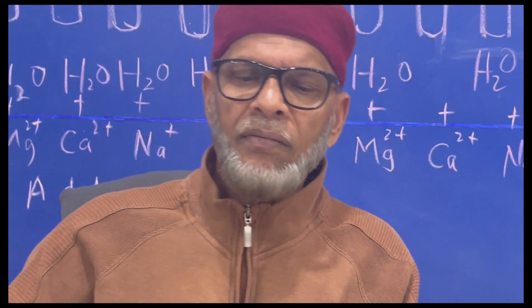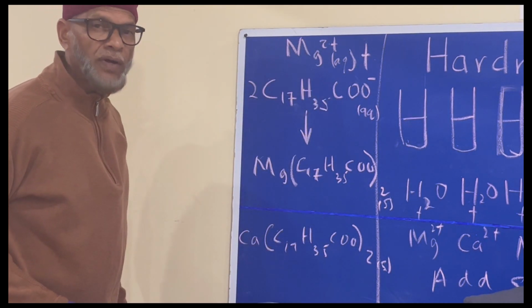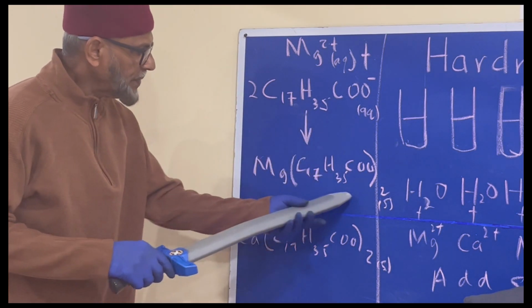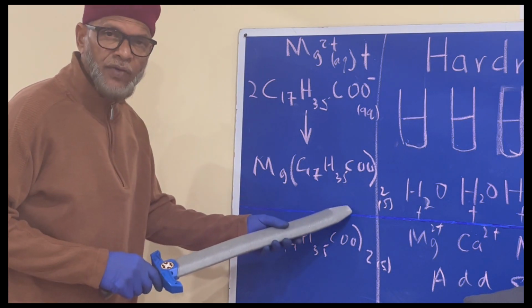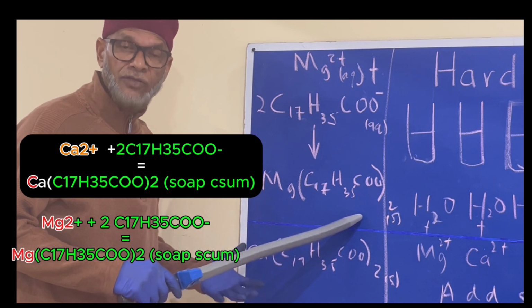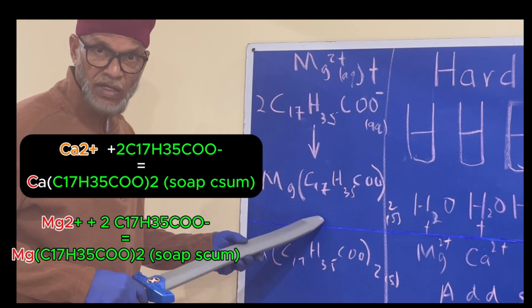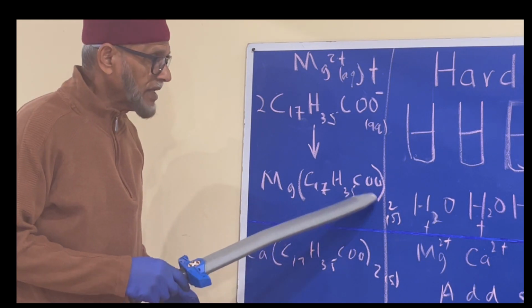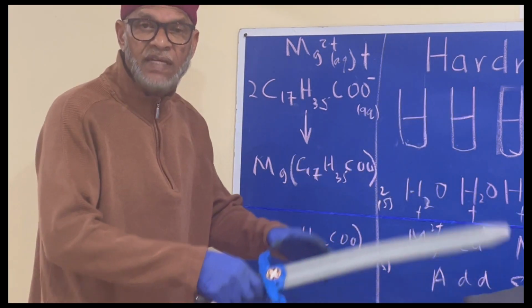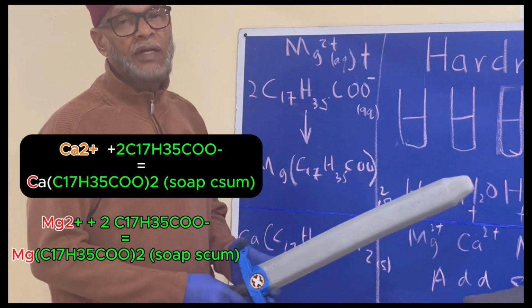Why does that happen? That happens because when either magnesium or calcium ions, or both of them, are present in the water, they react with the soap molecules to form a precipitate. This comes out as what is called soap scum. This is a nuisance to the guy who operates the laundromat because it is deposited as a white substance on the clothes. Also, the solid that is formed goes through the drain, and sometimes deposits as what is called pipe scales, and gradually the bore of the pipe becomes smaller and smaller, and it can cause blockages of the pipe.